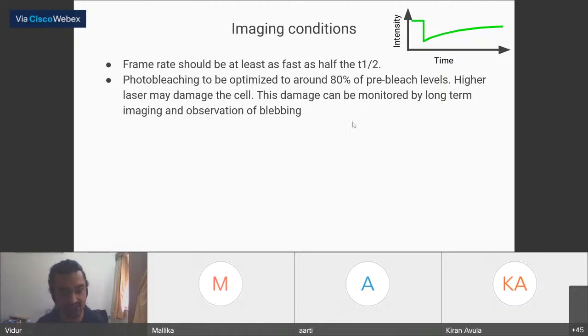It depends on what system you're using. I'm not going to show our neurons case, because it's very different from system to system, and that has to be standardized based on the system that you're using. As an example, if you have HeLa cells, they will start blebbing over time. If you have primary neuronal cultures, they will show a reduced amount of neurites that they throw over time. So this damage has to be observed based on the system that you are using.